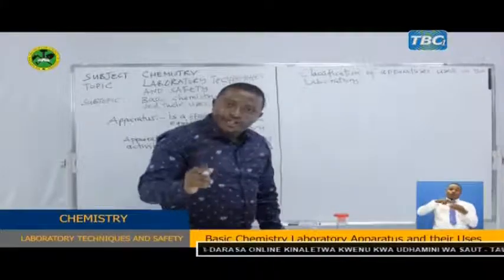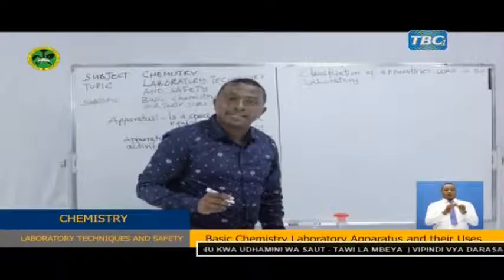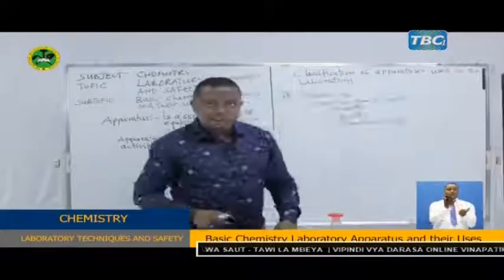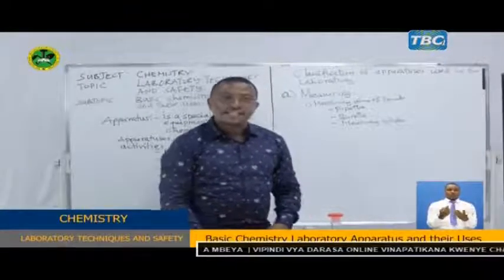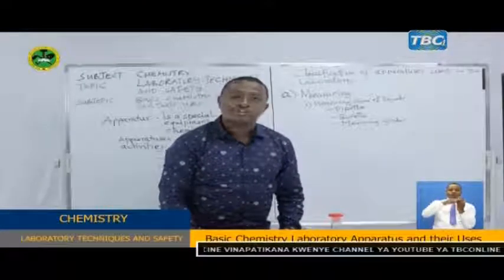Apparatuses used in the laboratory, dear student, are categorized into apparatuses for measuring. Now, student, let us see these apparatuses for measuring volumes of liquids.